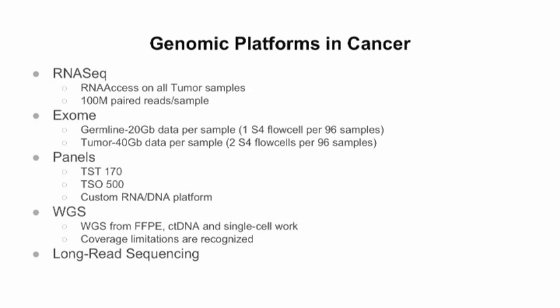Trying to tease out much more of the genomic and genetic complexities within cancer that are clearly driven by copy number variants, which are actually, I think, becoming increasingly well recognized as important. And then the last thing about this slide is this is certainly from most mature to least mature as far as platform, and in fact, most highest number of samples to lowest number of samples in terms of the workflows.